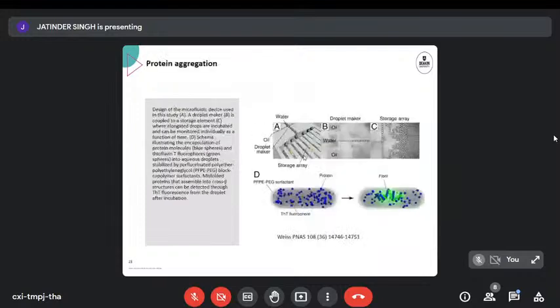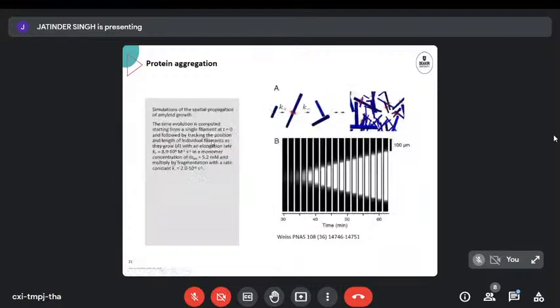This is what Annette just already referred to, and that's a way of looking at protein aggregation. So here, a large-scale droplet maker was coupled to a place for easy study. So pretty much a parking garage, a parking lot for droplets. The droplets come in, end up in a narrow channel, and this narrow channel was made long because it made observation of the droplets easier as well.